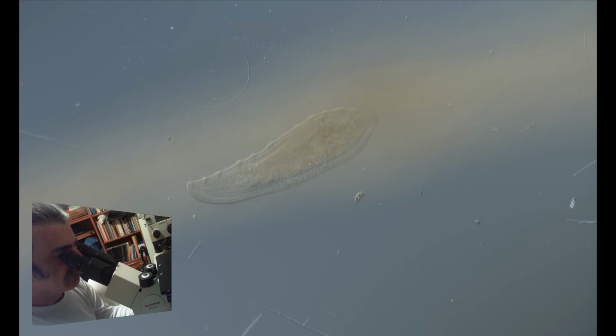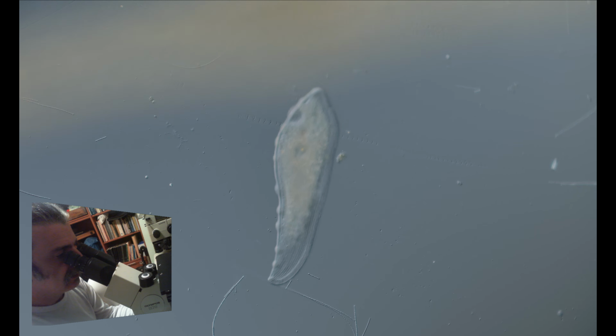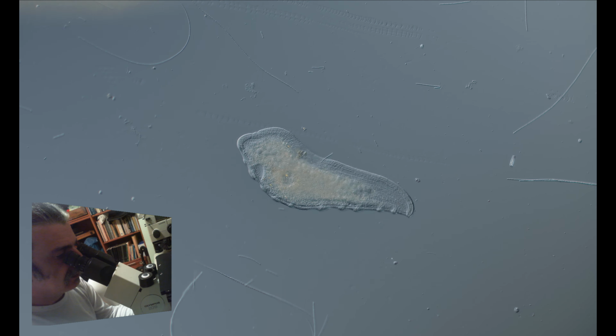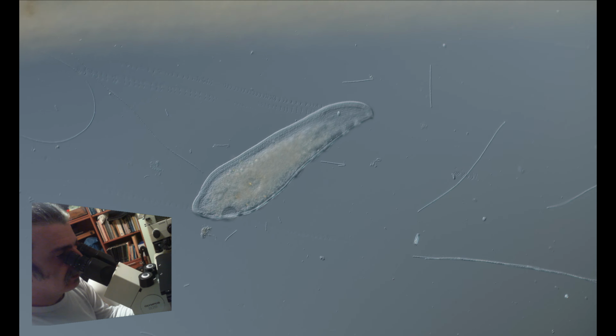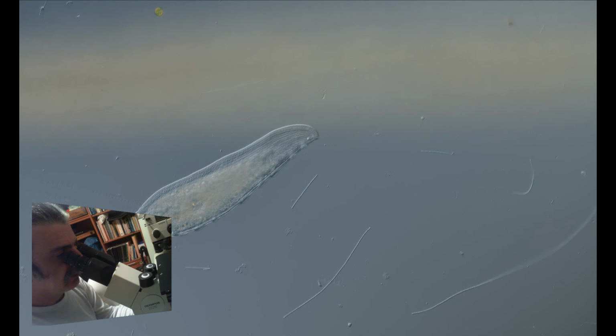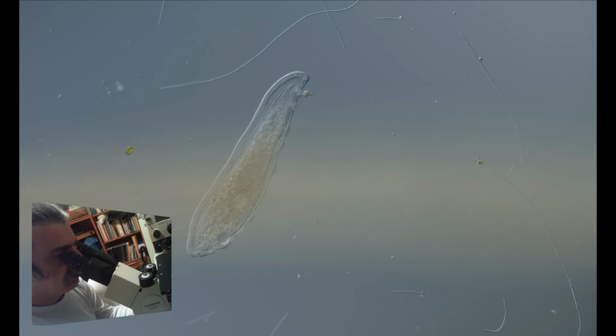Those warts, you can see the cilia around it, and those warts contain some venom organelles exactly like the hydra, called nematocysts.